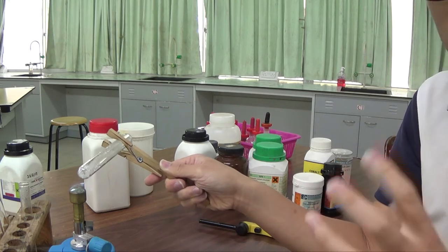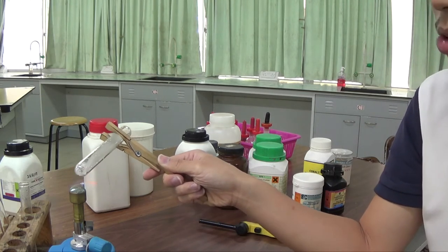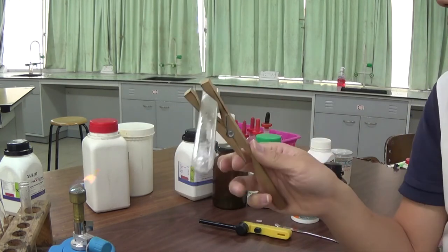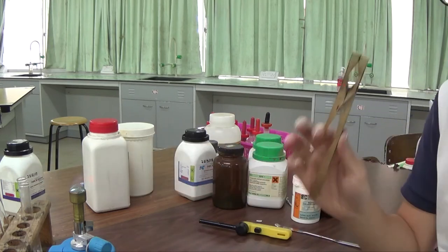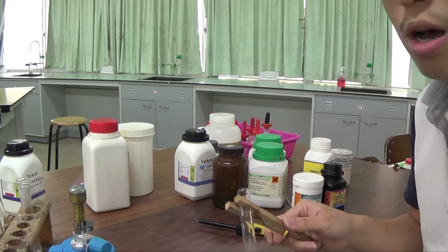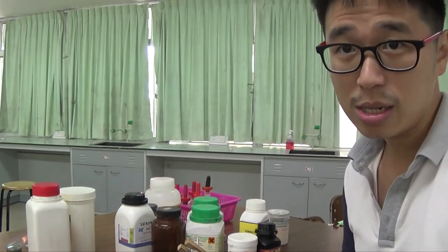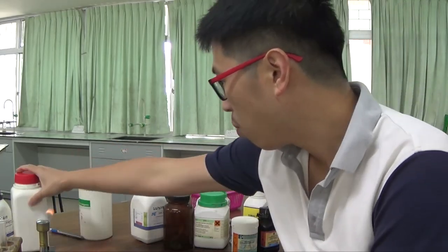When they get to the upper part of the tube, which is cool, they will condense into a colorless liquid. Again, when you heat a solid, whether it's a white solid or a colored solid, as I'll show you in a little bit, you get a colorless liquid forming on the upper part of the tube. You should really be thinking the compound is hydrated. The compound contains water of crystallization. So enough on the white colored compound.